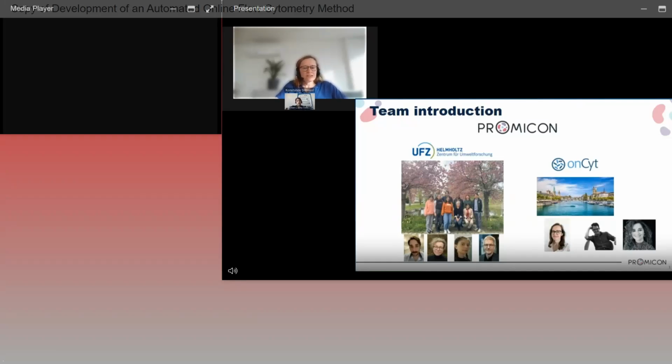Here for this project, there's a team of 2. That's the company onCyt that I'm working for. We are located in beautiful Zurich in Switzerland, and the people who worked on this project specifically were me, our CEO and founder, Michael Besma, and Marisa Silva, who you see in this picture here. We are a startup company. We come from the Aquatic Federal Research Institute here in Switzerland, and we develop automation technology that can be used with the Cytoflex. So maybe Juan, you can present your group.